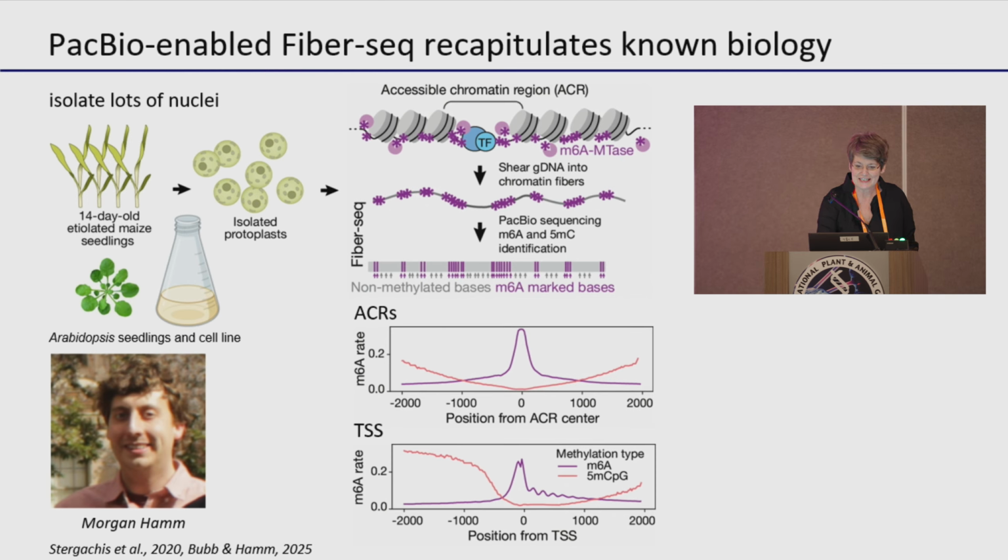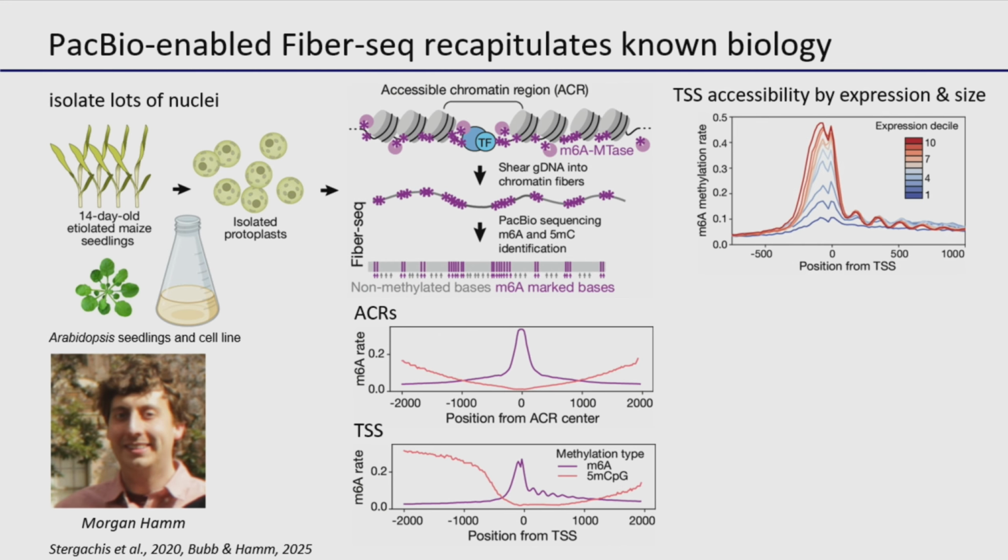What was very fascinating for me right away when I looked at this plot are these regular ripples downstream of the transcription start site. Let me show you that actually this accessibility signal, both at the transcription start site and at these ripples, is strongly associated with expression. The warm colors here, high expression. So the ripples are actually the well-positioned nucleosomes after when transcription occurs, which you can easily see because in the blue colors, where we have low expression or no expression, the ripples disappear.